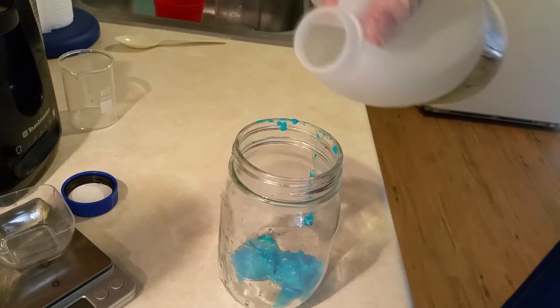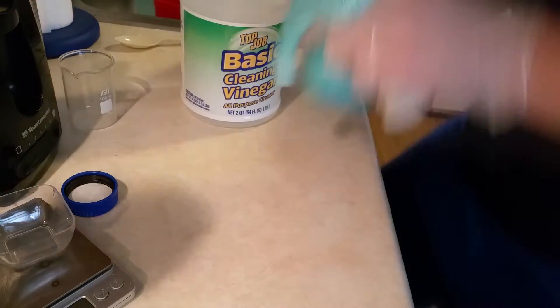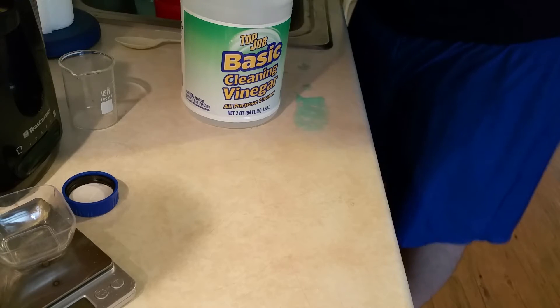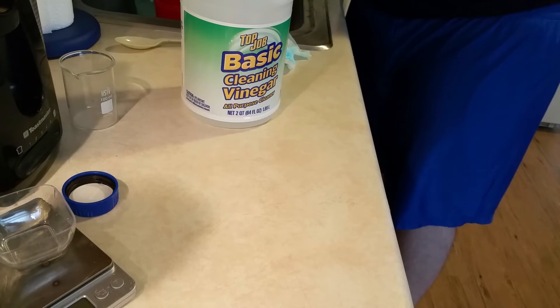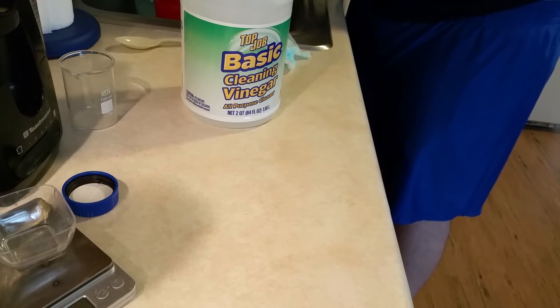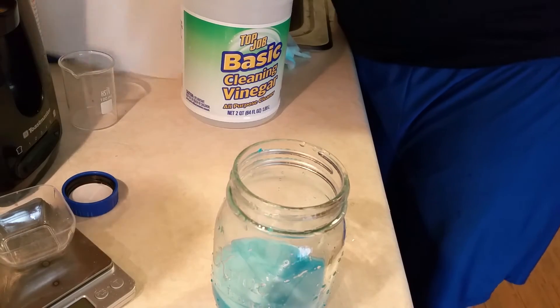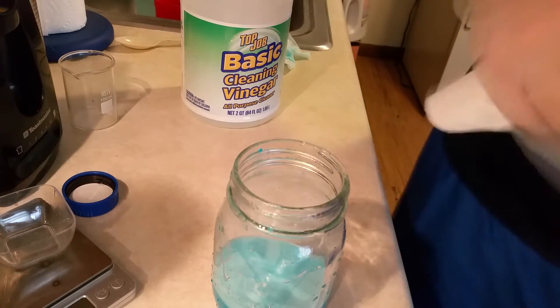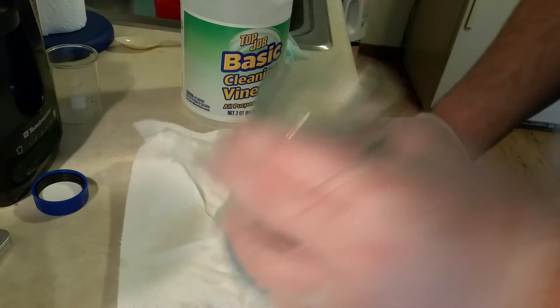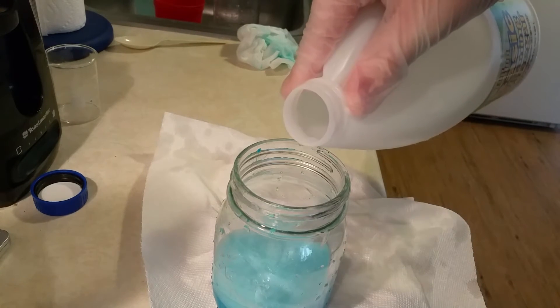I'm going to begin adding the acetic acid — and as you'll see, I added it way too quickly and it foamed over. I lost a bit of product and had to clean it up. Nobody's perfect: use a large vessel, wear gloves, clean your workspace. Now I'm going to very slowly add more in, making sure to vigorously stir. Again — disposable spoon, disposable towels, disposable gloves.